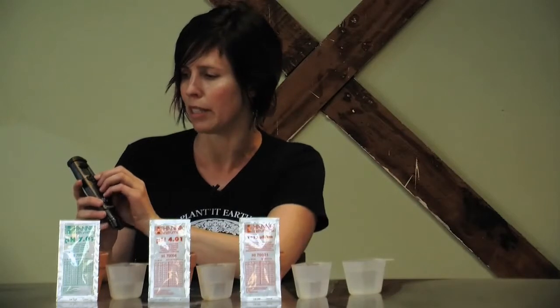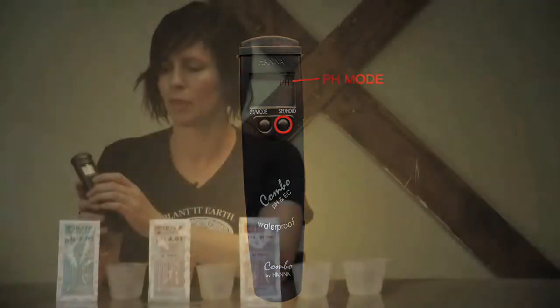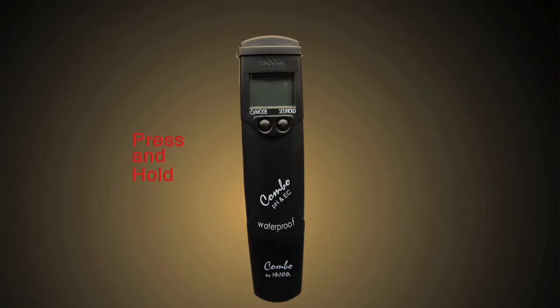First we're going to calibrate the pH mode. You can adjust what mode you're in by pushing the right button. You'll go through the pH, part per million, and EC mode. We're currently in the pH mode.